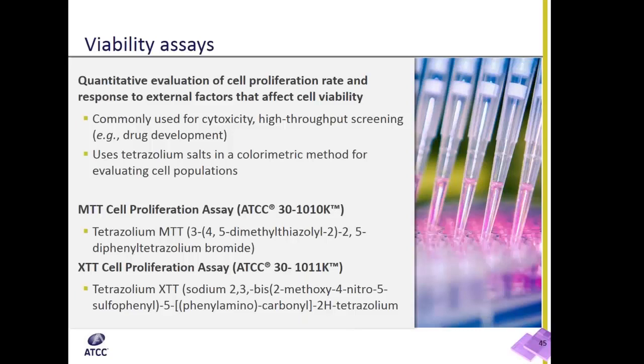The last part of the webinar is going to discuss viability assays and measuring growth and viability. Previously we talked about how to measure viability using the trypan blue simple cell count. Viability assays are methods in which you can measure the number of cells in a well and measure its current rate of growth. This is ideal for assays in which you would want to compare normal growing cells against an experimental factor, such as a cytotoxin, that would negatively affect growth.